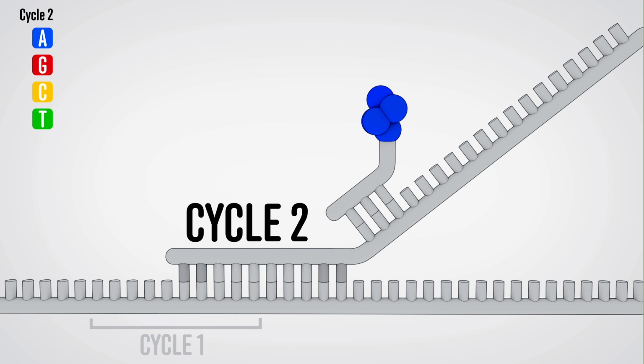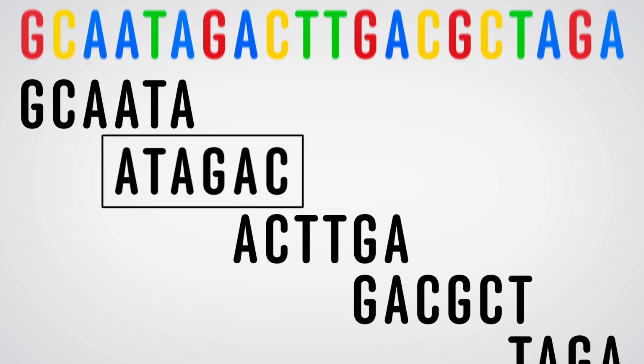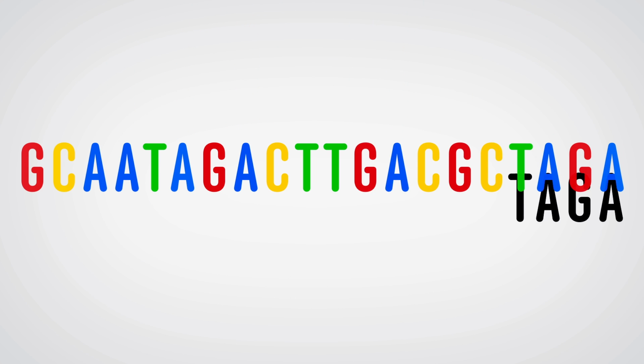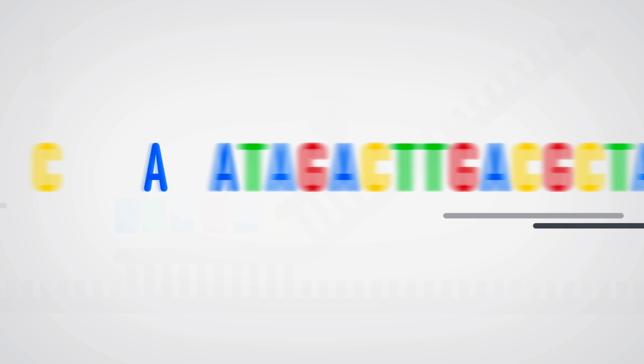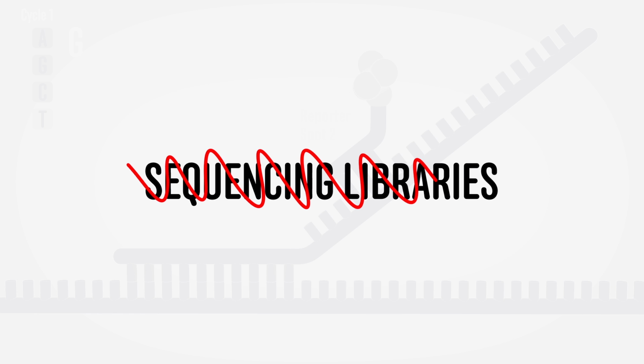Sequencing cycles are repeated until all the target regions have been sufficiently covered. The readout from each cycle is binned and mapped directly to a reference sequence. These readouts allow the generation of a multipass consensus to define the sequencing reads for the length of the target region. The HybSeq workflow requires no enzymes, amplification, or sequencing libraries.